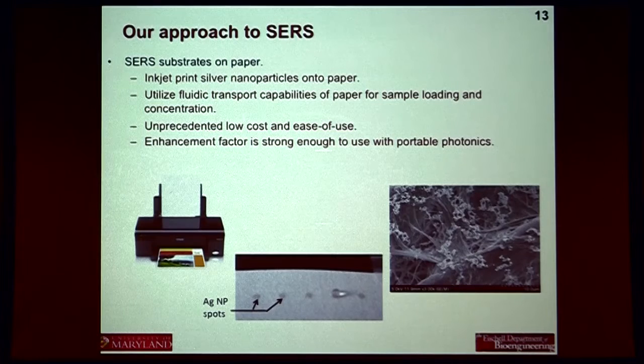What's the scale on that? Yes. So each little tick is 1 micron here. Each one of those little nanoparticles is about 80 nanometers or so, just to give you another point of reference. And these spots here, that's about a 1 millimeter spot. We just drew 1 millimeter circles on a computer, printed that out, and made 1 millimeter sensors.